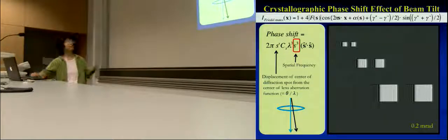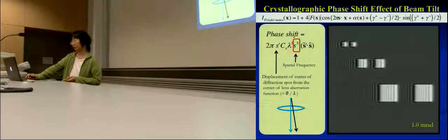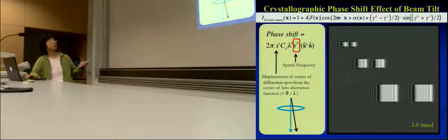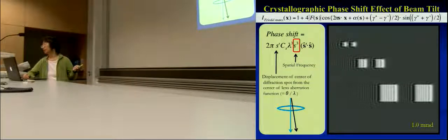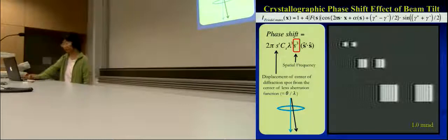That comes from the phase shift. Now, if I increase that even further, the effect is even stronger. And you see that if I have something like this and I try to determine the position of all these cubes, I'm going to be off on all of them. I have bigger trouble with the ones at higher resolution, trying to figure out the separation. The gap in between those becomes less and less obvious. So that's what happens. You go to higher resolution, it becomes a bigger problem.